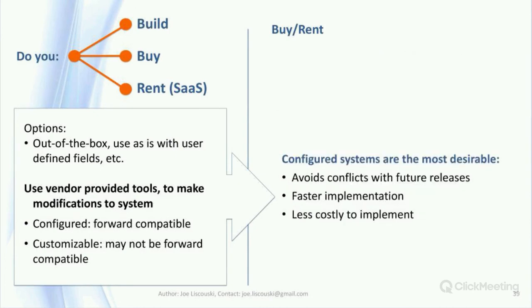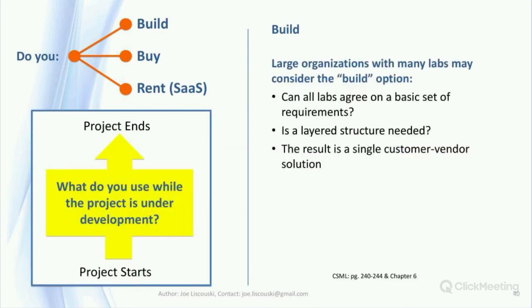If you can, configured systems are the best option. You don't want to find yourself in a situation where you spent a lot of resources developing software only to have to do it all over again when the next release of that software becomes available. Considering the amount of effort that's gone into these systems, it isn't likely that you'll come up with a need that requires custom software development. If you do find a unique need, contact the user community to see if others are having similar issues, and perhaps as a group, pressure the vendor to make the changes.